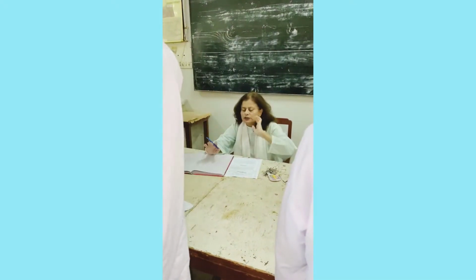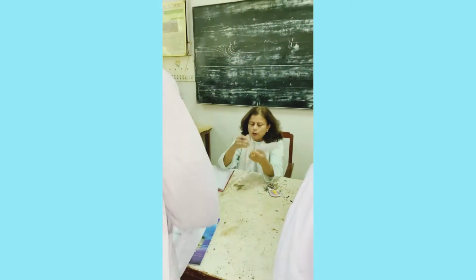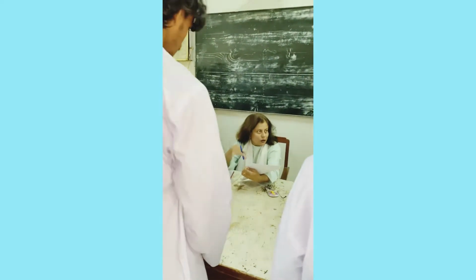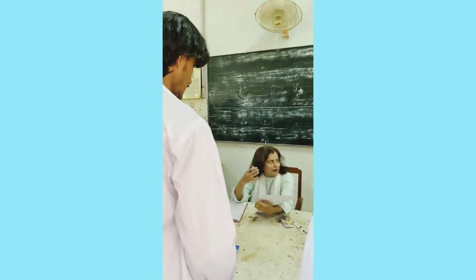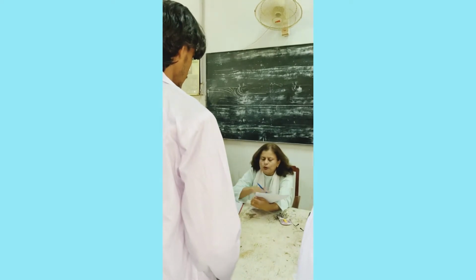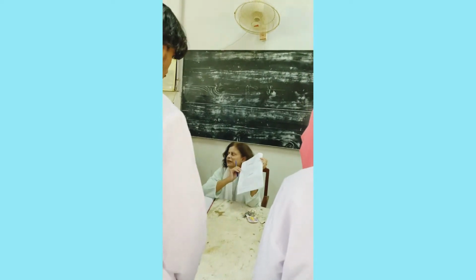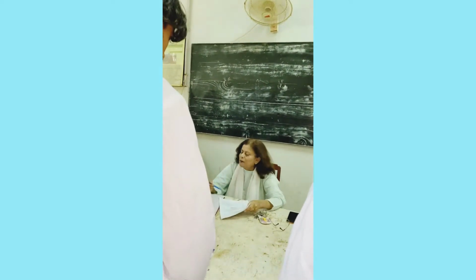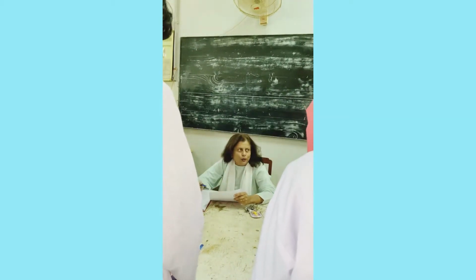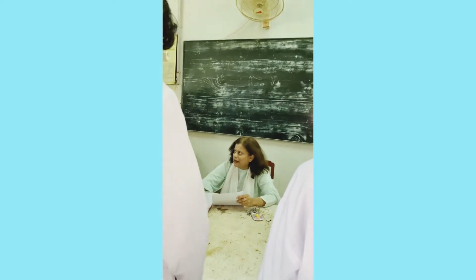Okay, you are going to start with this scheme. You have this new scheme. I welcome you all, right? In this semester, this is semester number 2, you are going to prepare organic compounds like I just told you in my general introduction. Have you attended my general introduction? So you need to prepare the organic compounds with the help of this scheme. Now in this scheme there are almost how many experiments? 8 experiments. And we are going to start with the one that has the simplest steps.